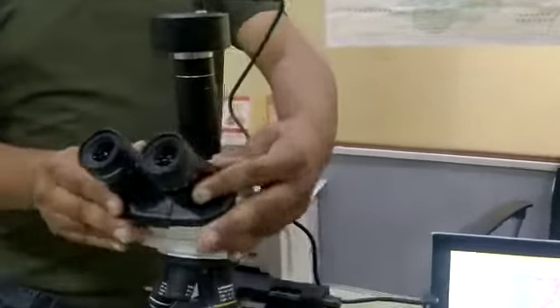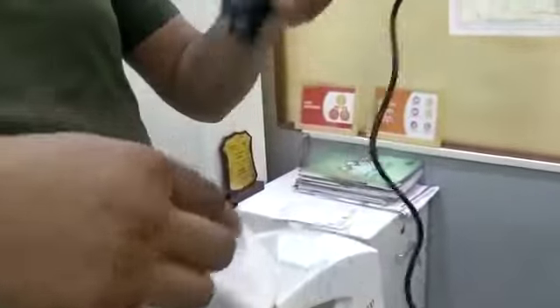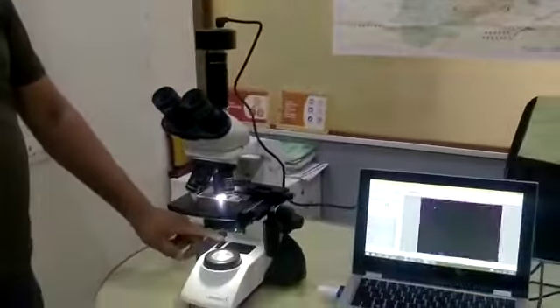This is the trinocular model. As you can see, there is a trinocular tube over here where you can fix the camera. The camera is fixed over here and the projection you get on the screen. It has also got LED light along with battery backup.